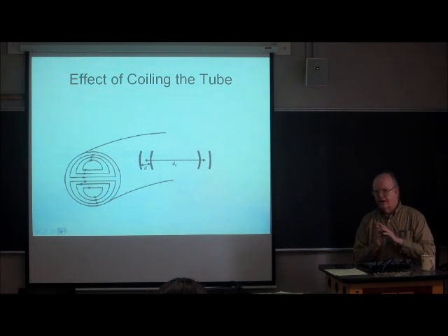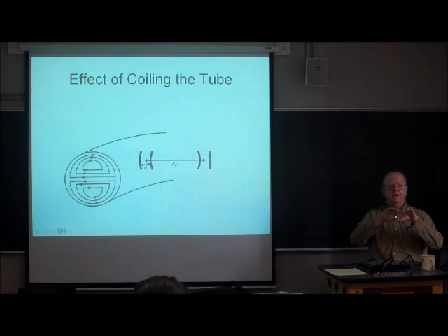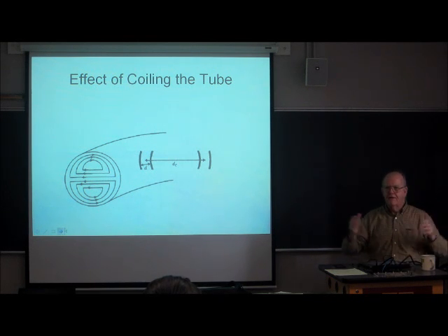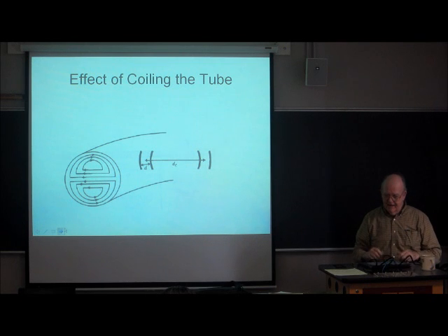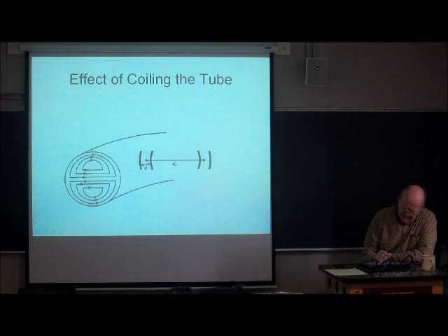There's one other issue that I didn't mention, but it's a real one, because more often than not, the tubing is not perfectly horizontal and it's not straight. You can't put 25 meters of GC capillary in an oven that's about that big, unless you curve it. And if you curve it, you induce what's known as secondary flows. So this picture here is supposed to be showing secondary flows, and these are the flow streams, like this.